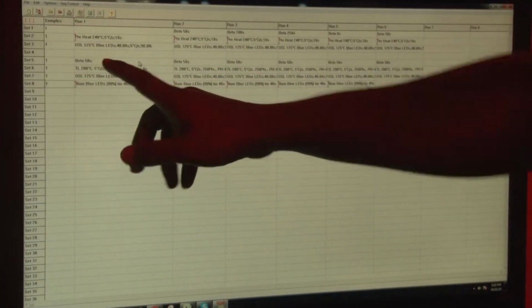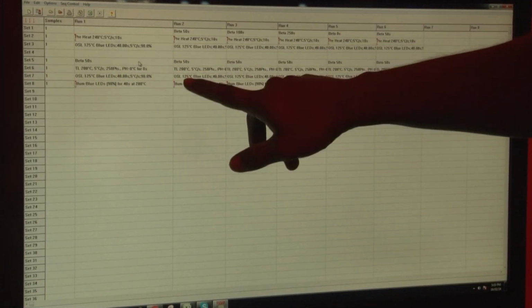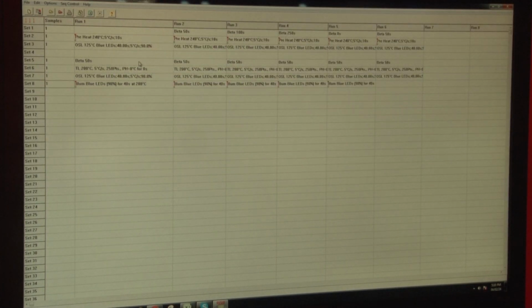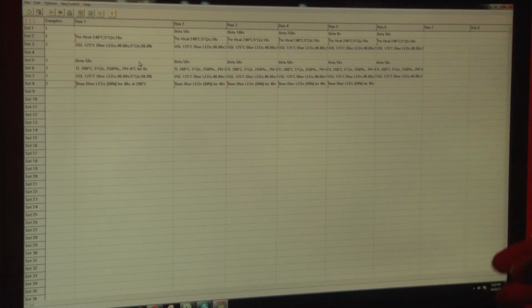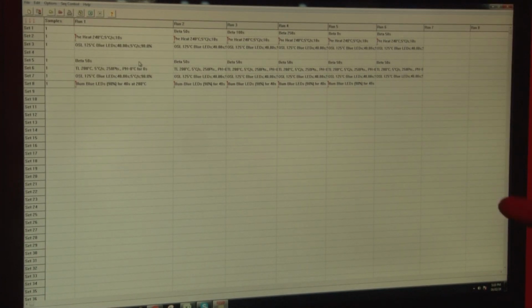You can see in each run we are using a constant test dose. The purpose of doing this is the sensitivity correction, because we are repeatedly applying temperature and then beta dose to the sample, so sometimes the orientation of the crystal structure changes.